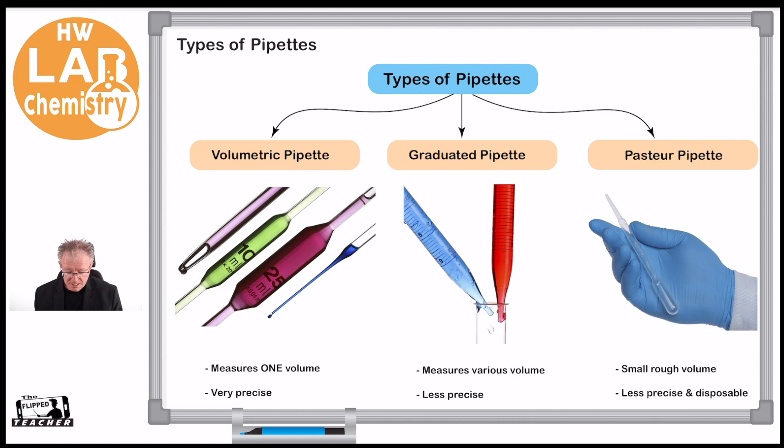You can see I've got volumetric pipettes with specific volumes that they're measuring—very precise, very accurate. These pipettes are used when we want to be incredibly precise with the amount of volume we want to measure or move from one place to another.